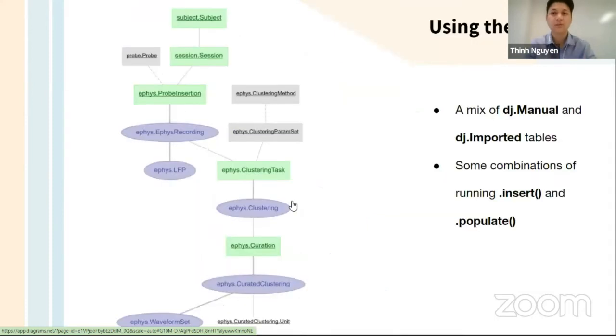All right, so let's talk about using the workflow, and later on we'll actually do some hands-on workshop to actually use it. But right now I want to give a high-level description of what you would typically do as an experimenter for your data, right? So this is essentially the pipeline, like a truncated version of the pipeline that you would probably be interacting with the most, right?